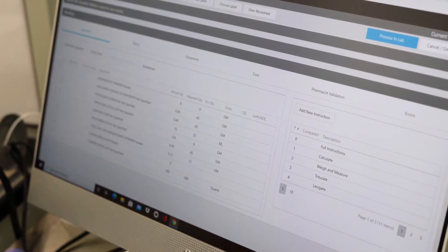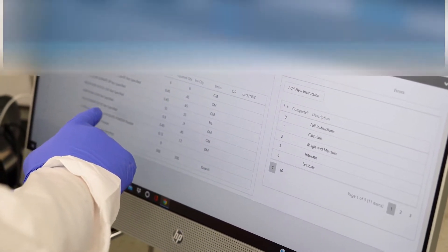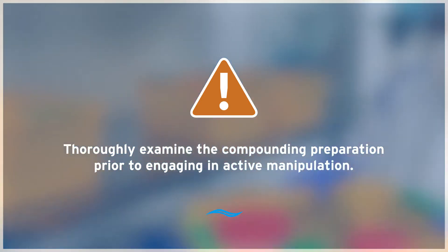As a best practice, the compounding preparation should be thoroughly examined so that all of the necessary materials are staged inside of the CVE prior to engaging in active manipulation.